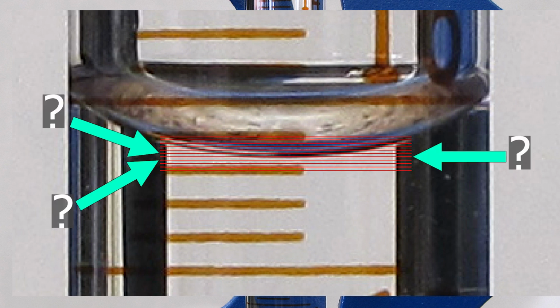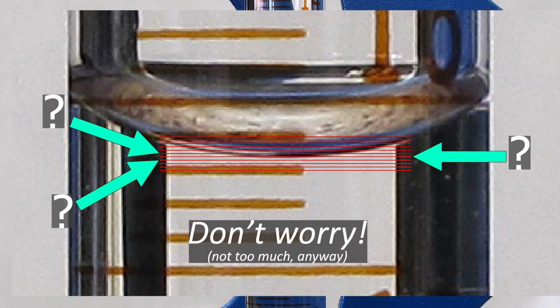Of course, when you go to do this yourself, you won't have any thin lines to help you out like the ones in this example. And yes, this does make it a little harder to figure out what that last digit is. Just estimate it as best you can, and don't worry too much whether your estimate is a little high or a little low. With some practice, you'll get good at estimating in no time.